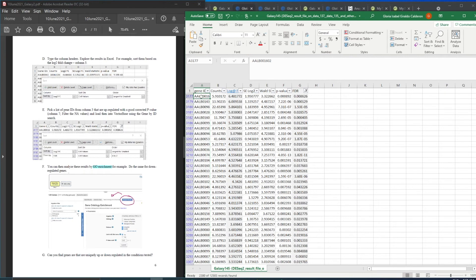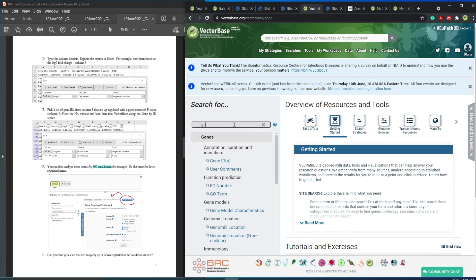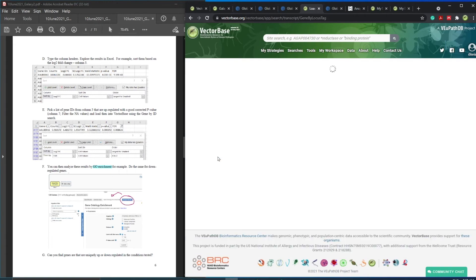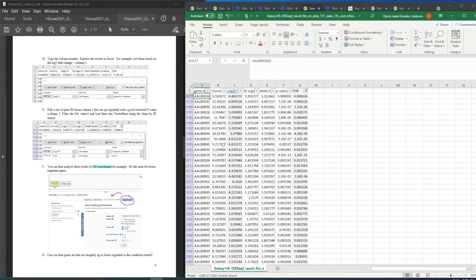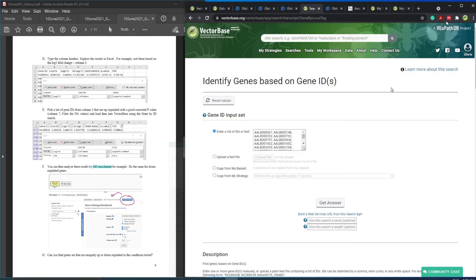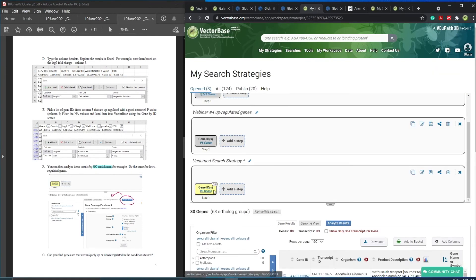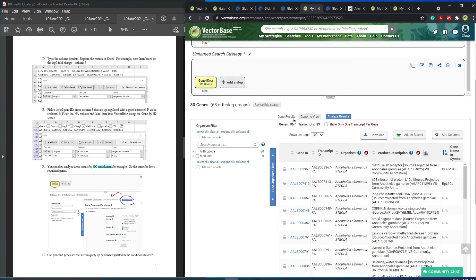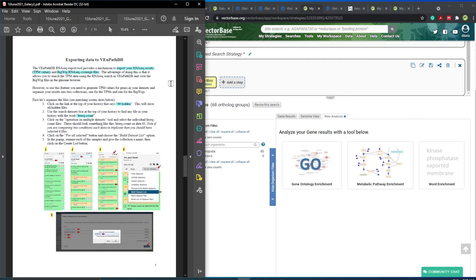Once you have sorted by log2-fold change and false discovery rate, you can copy the gene IDs — for example the first 100 — to look at them in VectorBase. Come to VectorBase and select gene ID search. You paste the gene IDs and get an answer back. You can also export your data to VectorBase — both your RNA-seq counts and the BigWig files, which you can visualize in our genome browser. To do that, go back to Galaxy and find all the HTSeqCount files by searching 'HTSeqCount,' select those files, and build a dataset list — these are your gene counts.